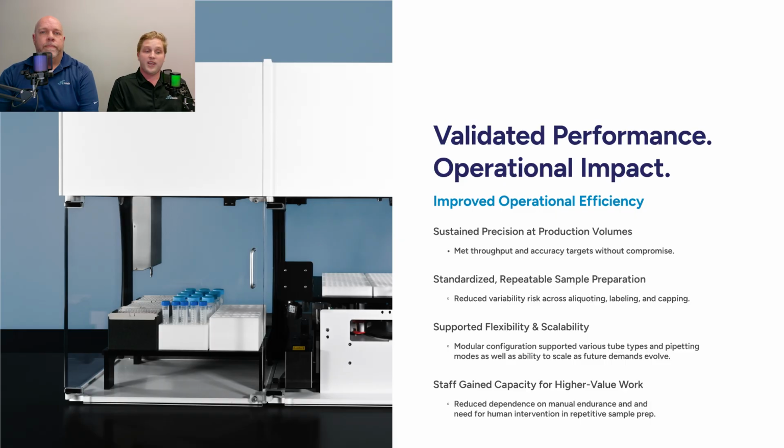And then the staff also gained capacity for that high value work that they wanted to do, right? So the data analysis and all the things that scientists are going to be proficient at. It got rid of some of those more mundane processes that the automation took over, which was, again, very valuable for this lab.